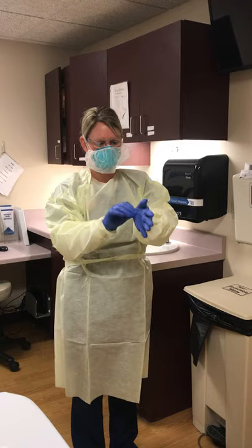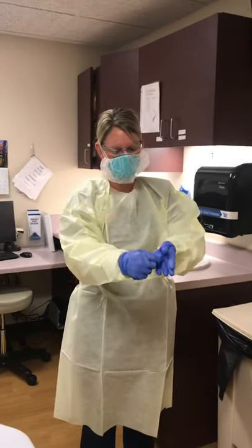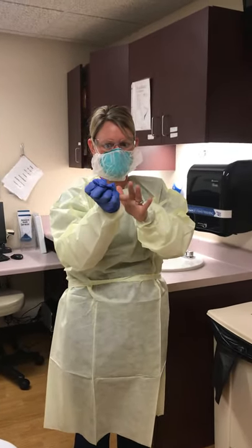First, glove removal. Being cautious not to touch the outside of the gloves.